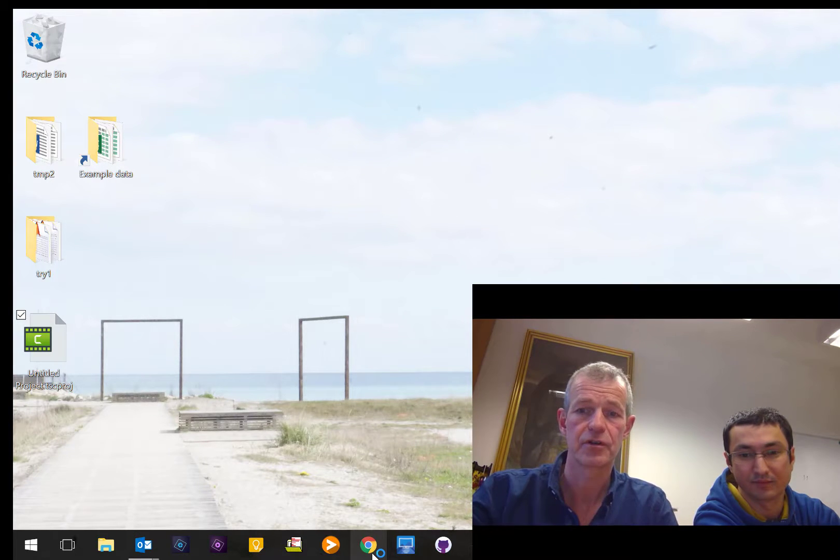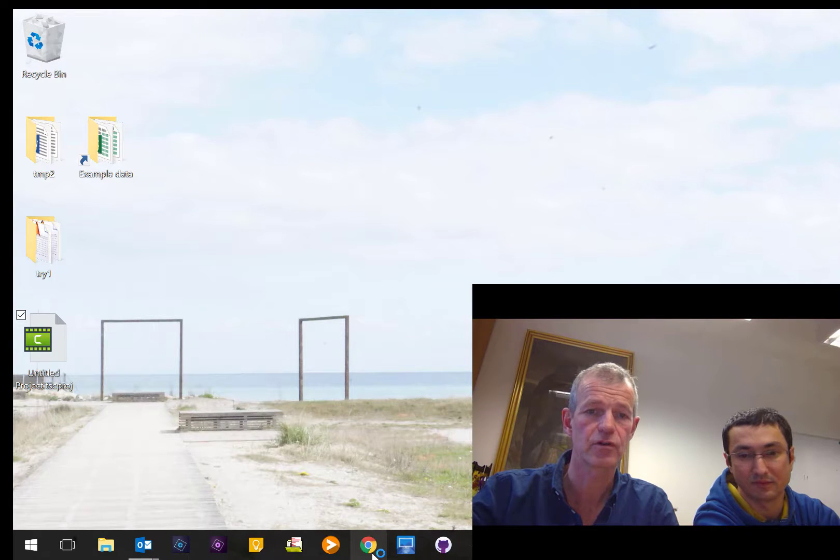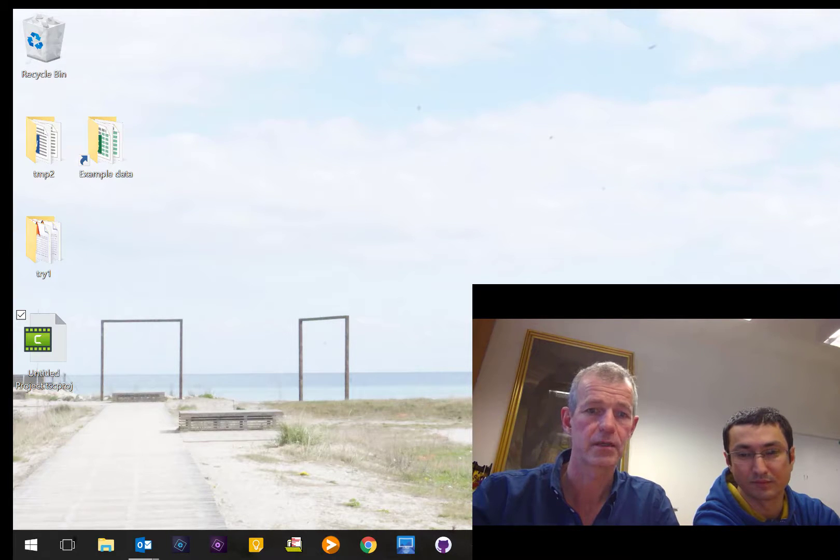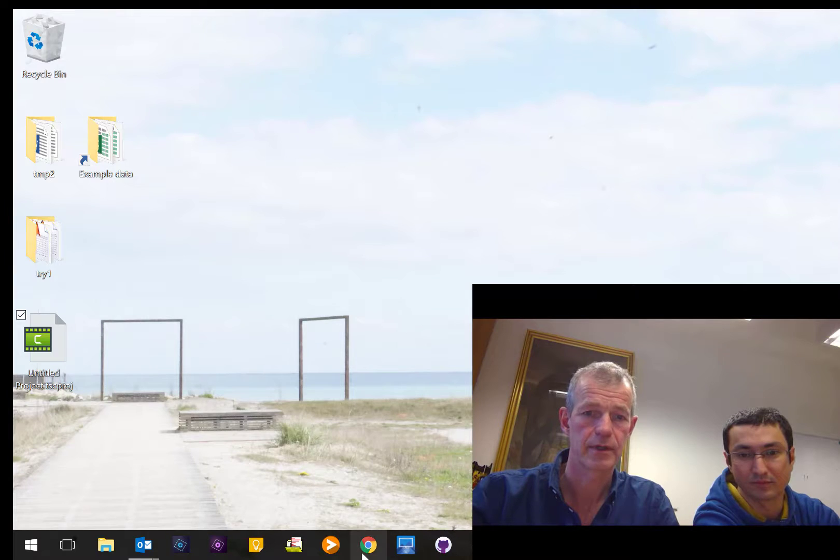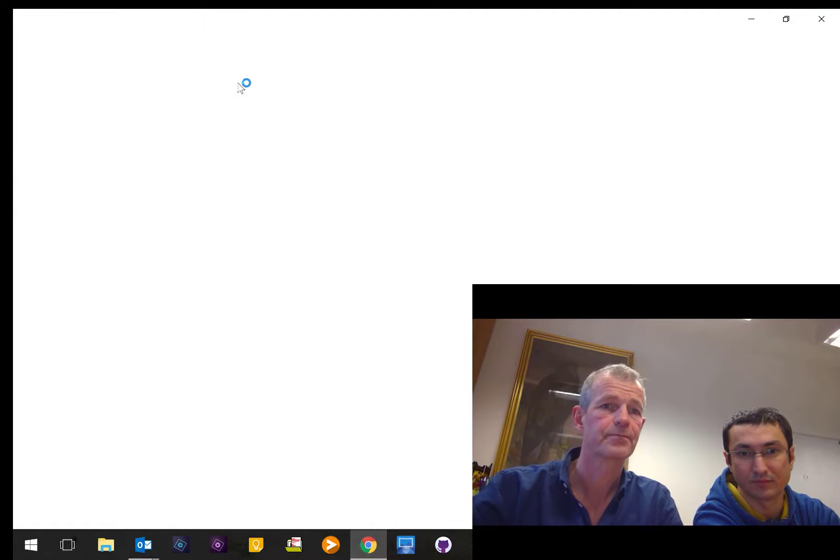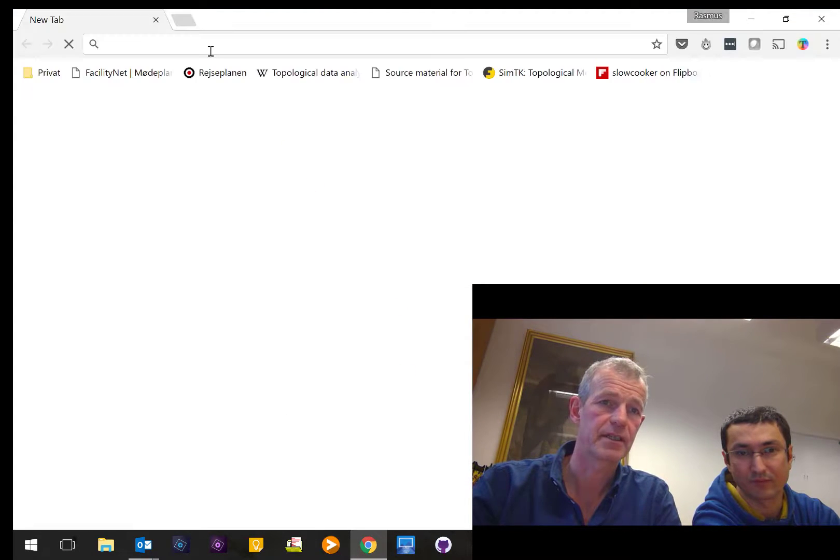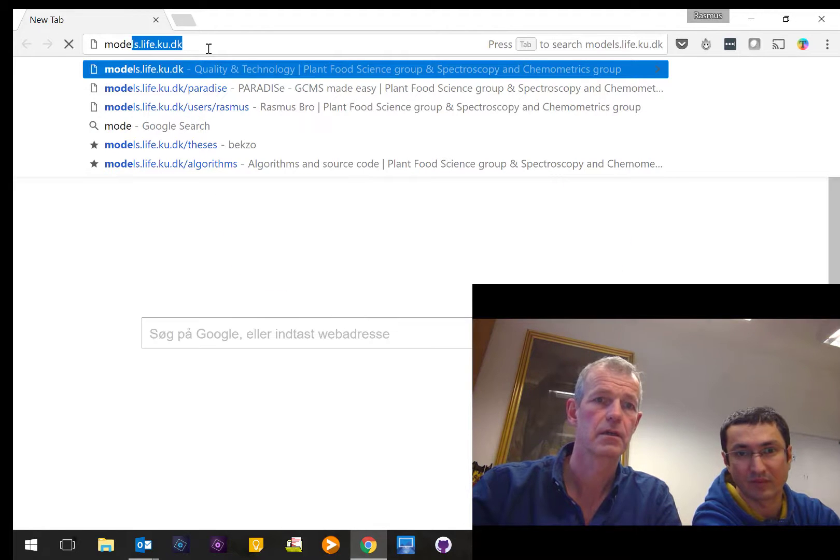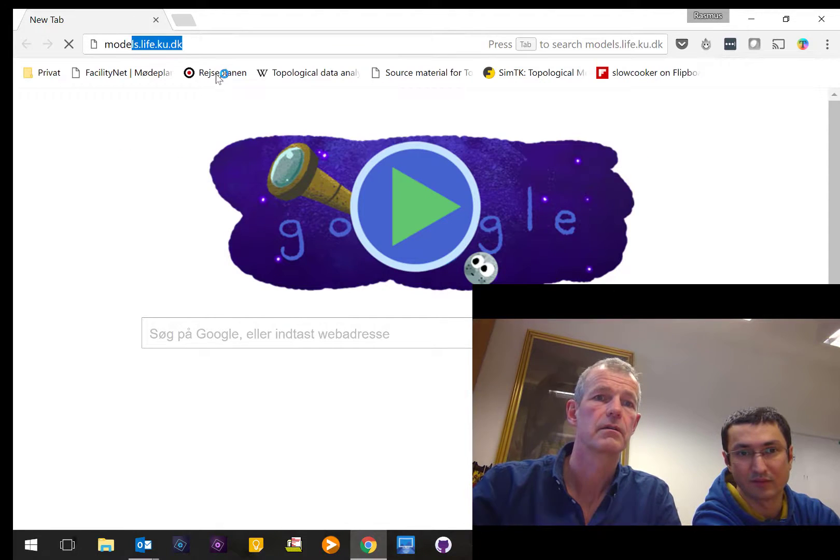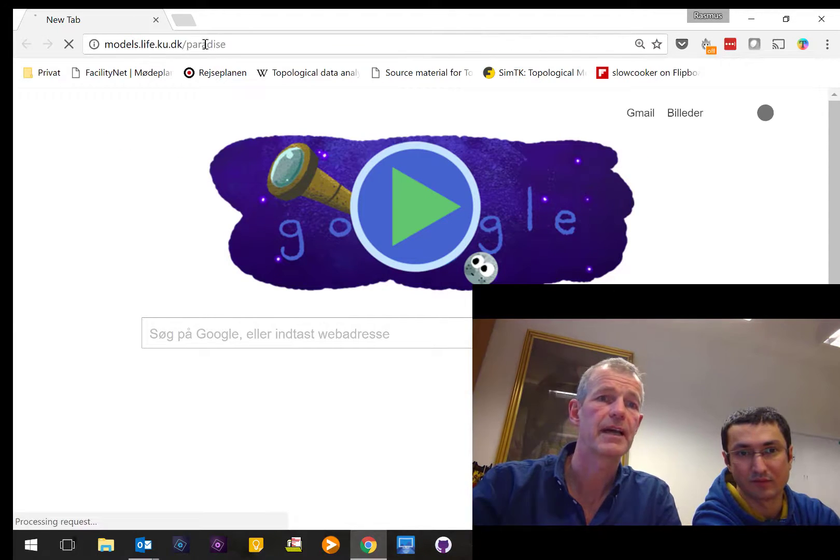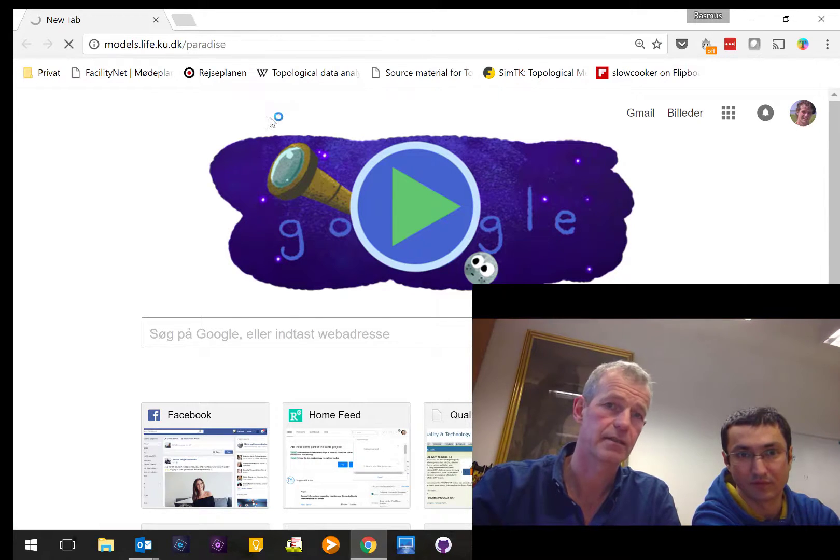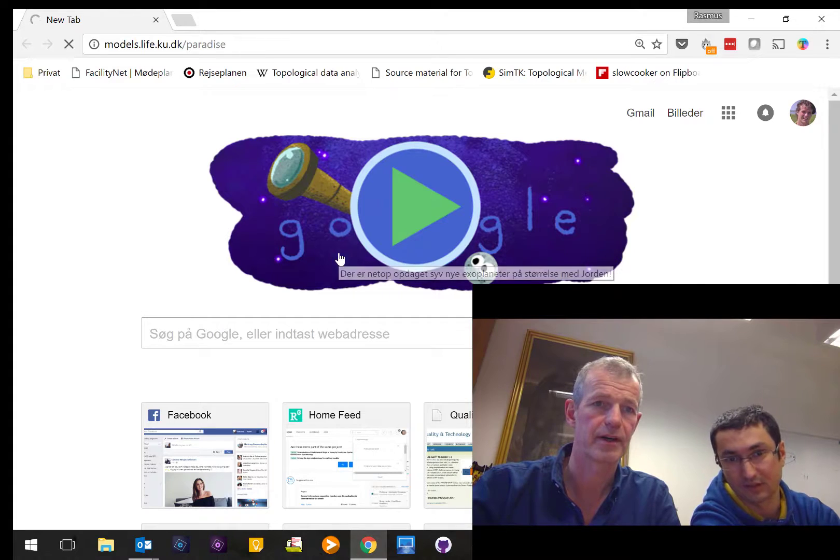For you to use the software, you have to go to our homepage. Let me just open the homepage. The webpage is models.life.ku.dk/paradise. The software is called Paradise.